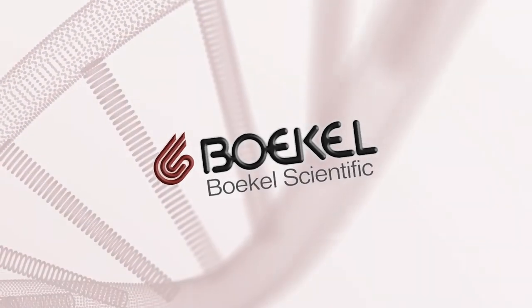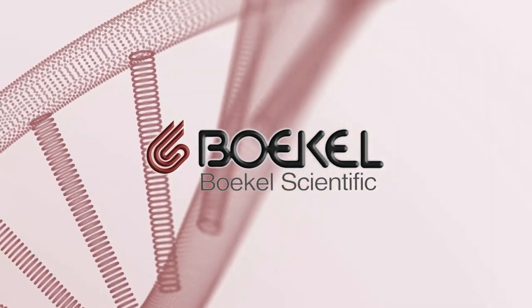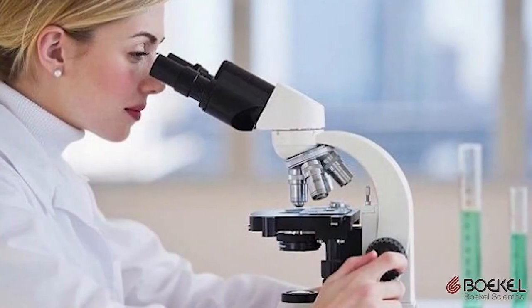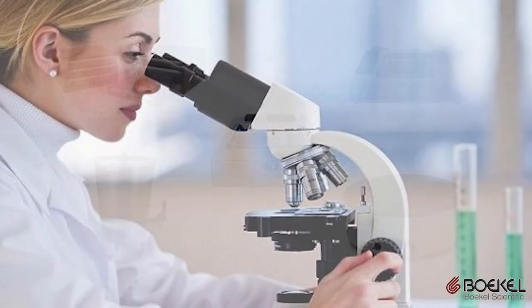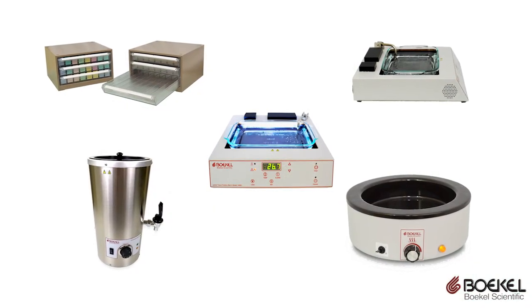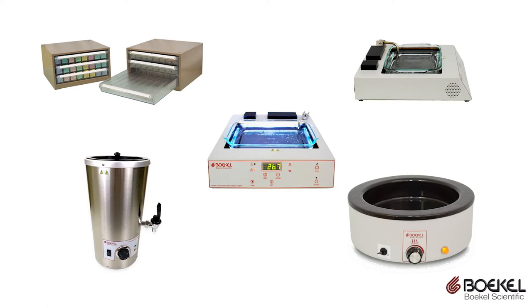Boekel Scientific, a leading U.S.-based manufacturer of laboratory and medical equipment, has been building histology equipment for over 100 years. From tissue flotation baths to slide storage, Boekel Scientific has your slides covered.